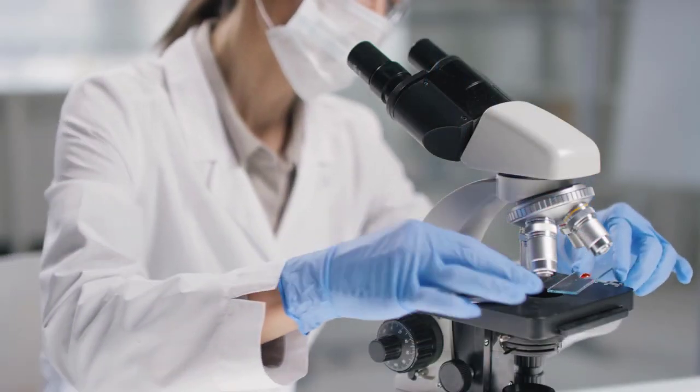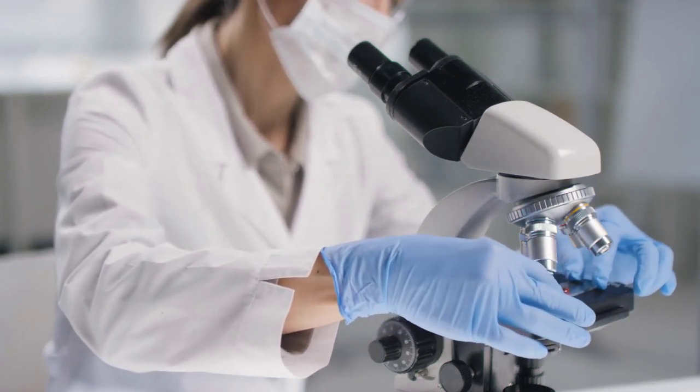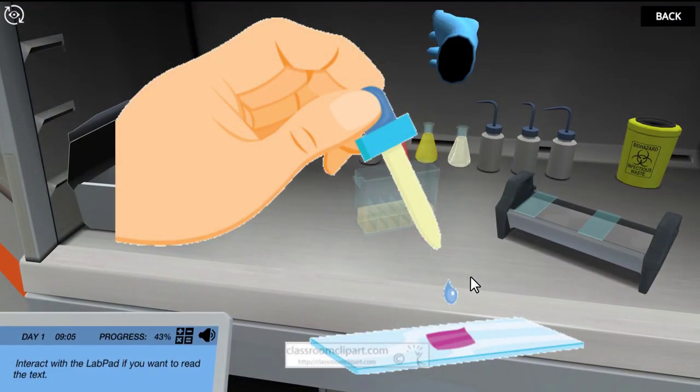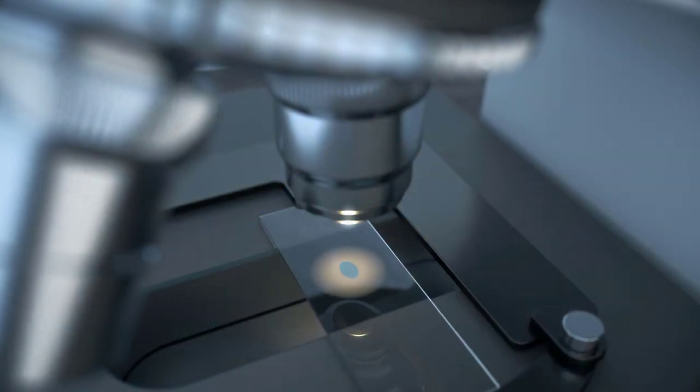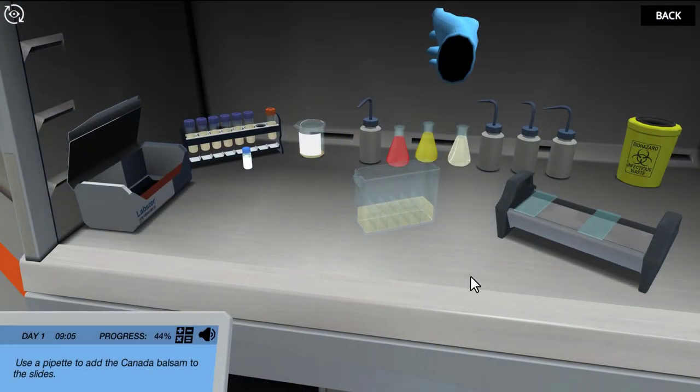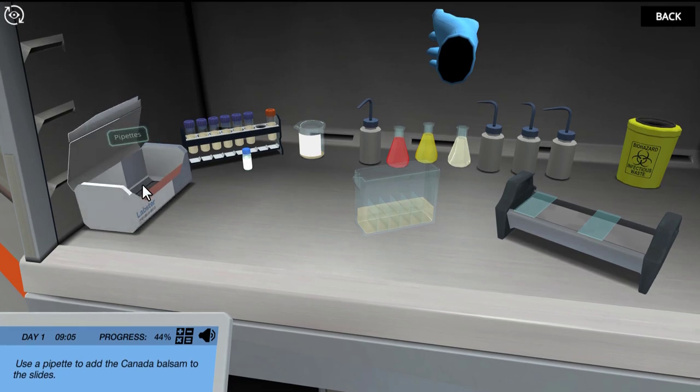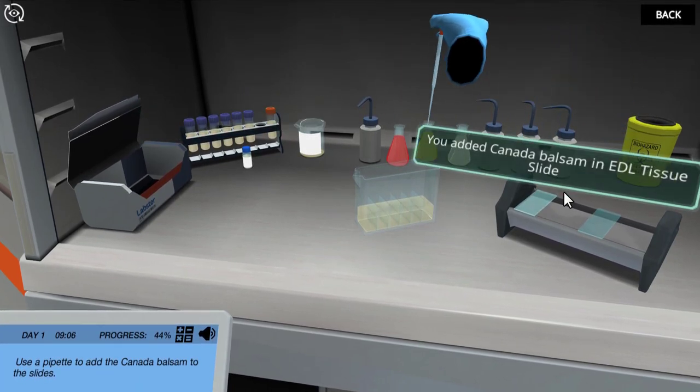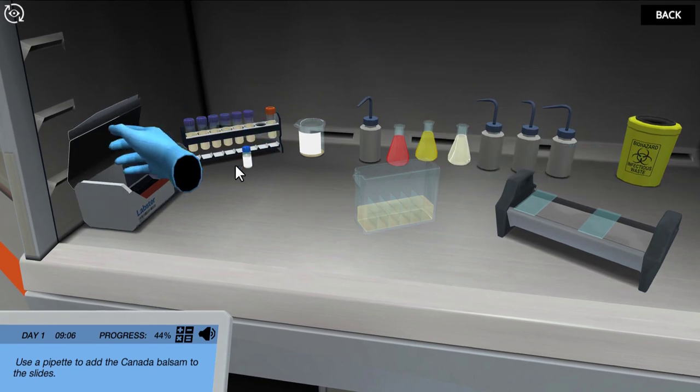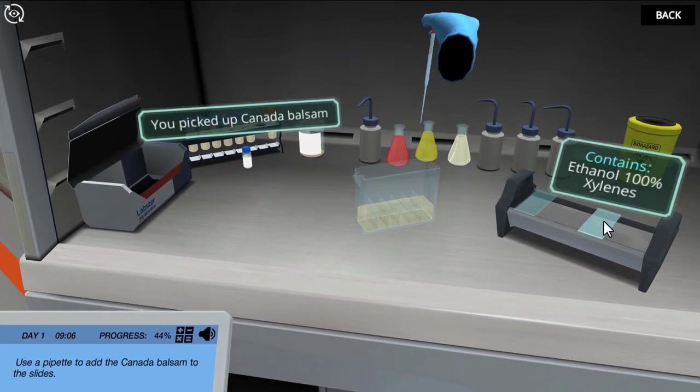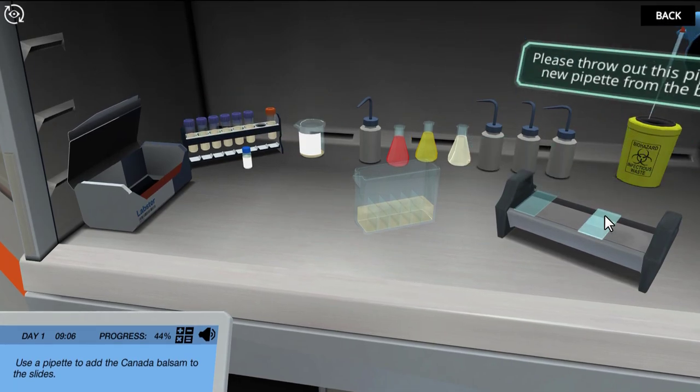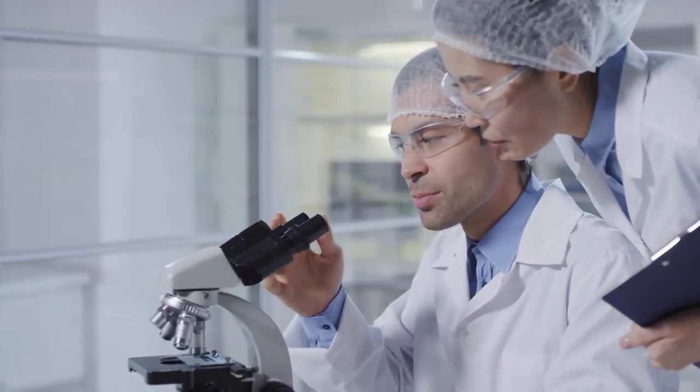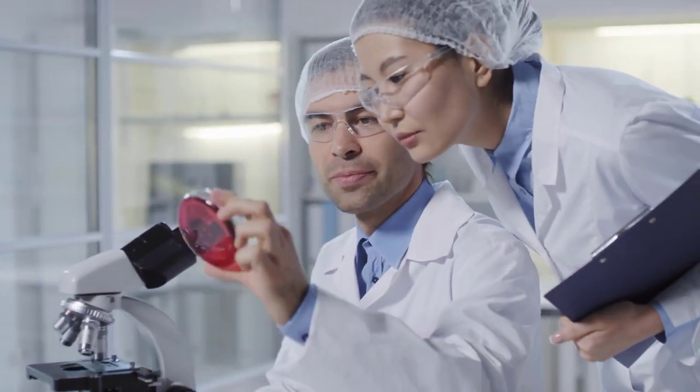Finally, we are at the last step before we can look at the two tissue samples under the microscope. You have dissected, sectioned, stained and washed these muscles. The last step is mounting the slides with Canada Balsam, which is a sticky glue with optical properties like glass. Slides prepared this way can last more than 100 years. Use a pipette to add the Canada Balsam to the slides. This was only one of the histochemistry assays we discussed earlier that allow you to look at the differences between the soleus and EDL muscles.